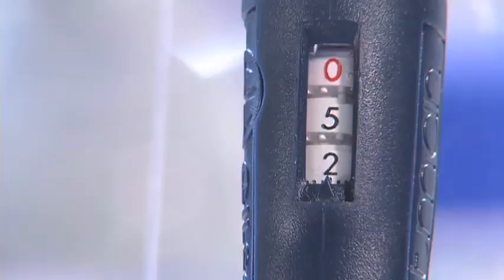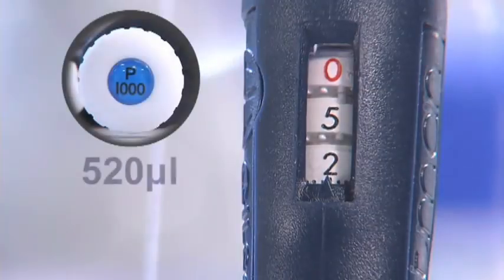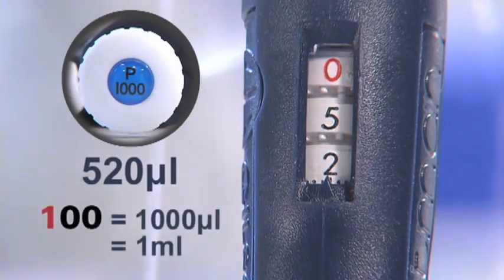This P1000 is set to 0.52, which indicates a volume of 520 microliters. A setting of 100 indicates the maximum volume for this pipette, which is 1000 microliters. The uppermost number is in red, which for this pipette indicates the number of milliliters.